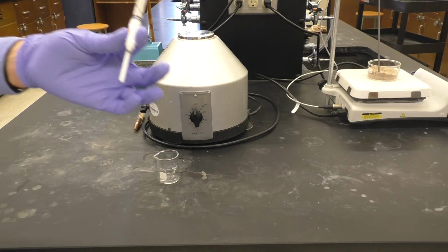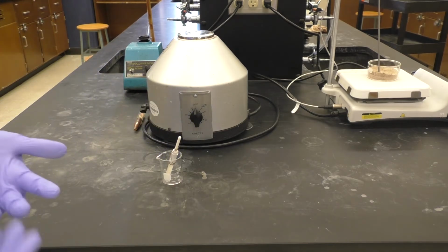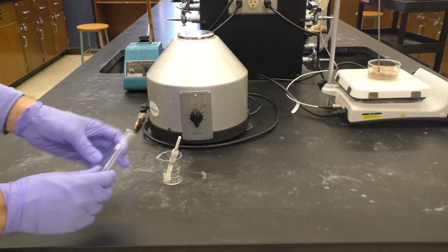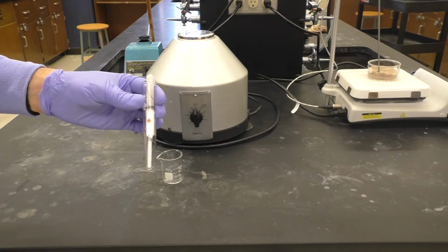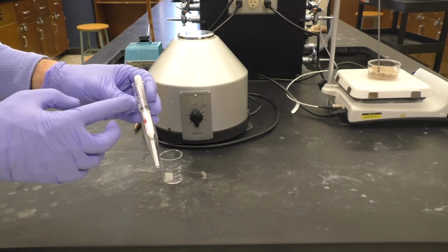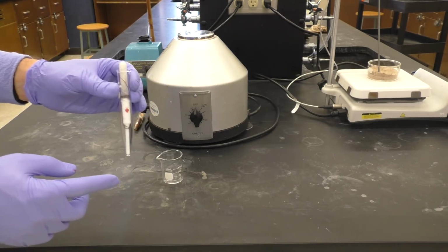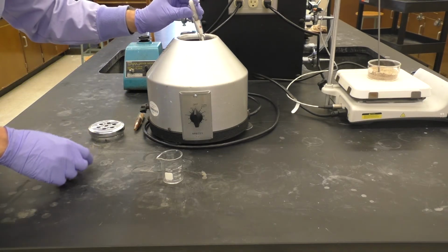And what I'll do at this point is I'm going to take the tube, now I'll put it upright here for a moment, and I'll grab a centrifuge tube. And I'll take the centrifuge tube and I'll put the Craig tube upside down into the centrifuge tube like this. So now I've got the plunger roped to the Craig tube using copper wire and inside the centrifuge tube. This will now allow me to place this into the centrifuge right here. So I'll place that in.